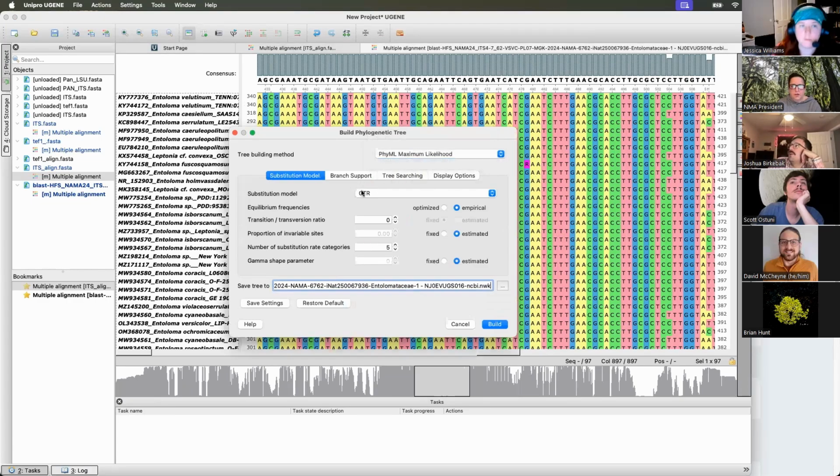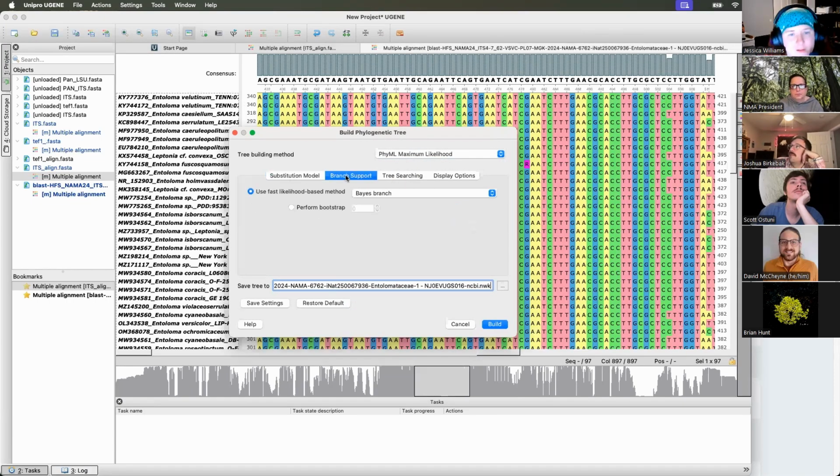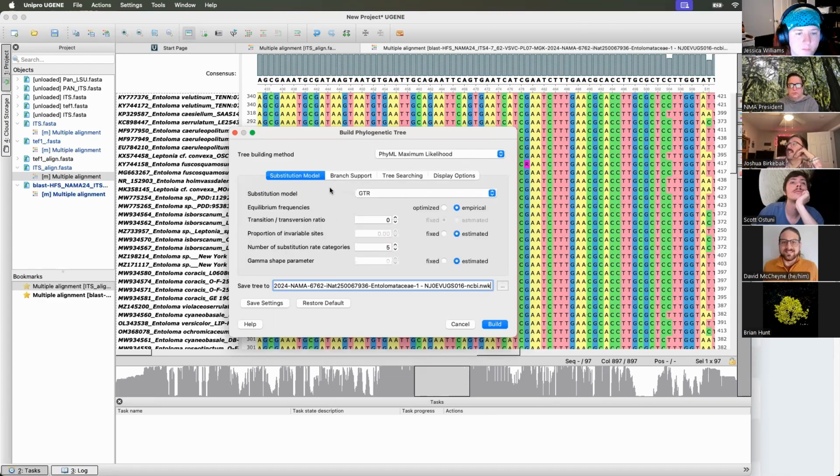If you did want to do just here, by the way, in PhyML and maximum likelihood, here is where you would tell it how many bootstraps to do. You'd probably want to tell it to do bootstraps, but it's probably going to do Felsenstein bootstraps, which are different than the ones we're doing, and they're probably going to take a lot longer. That's one of the main things that I don't like about using this: it doesn't automatically search for models for you.